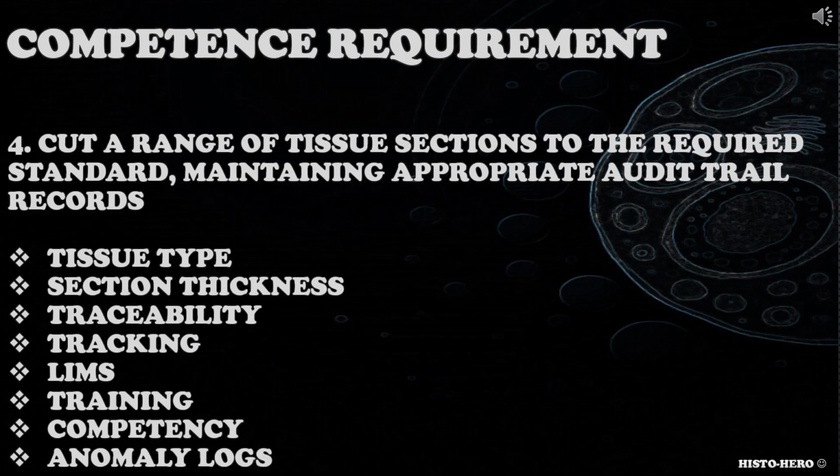When addressing this competence requirement, candidate could consider various tissue types they can cut, number of sections required, section thickness required for this analysis like H&E, IHC, or molecular testing, traceability, tracking systems used in their lab, LIMS system used, their training and competency, anomaly logs and so on.